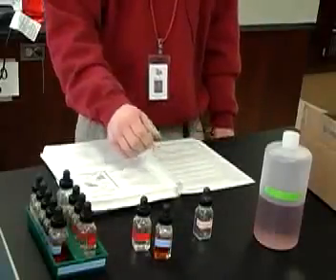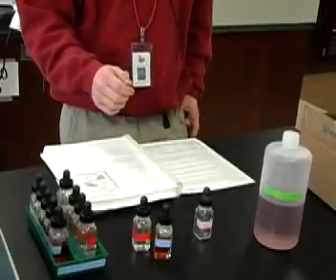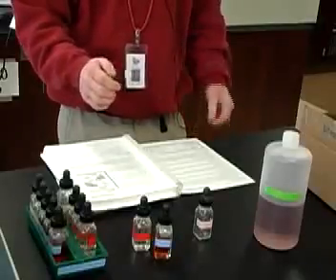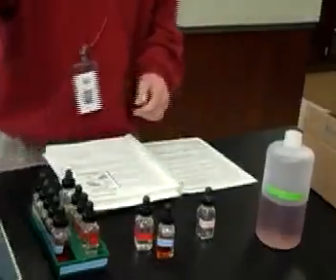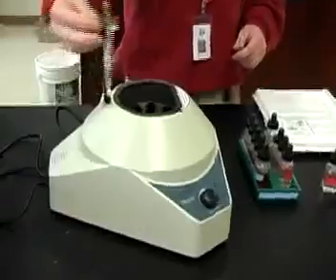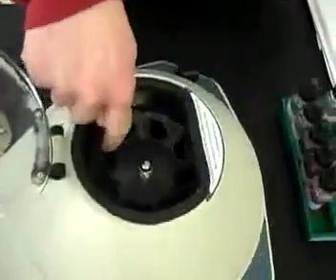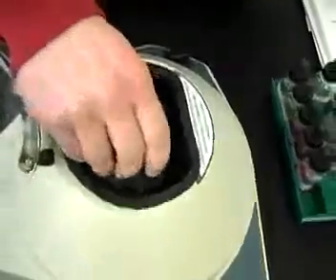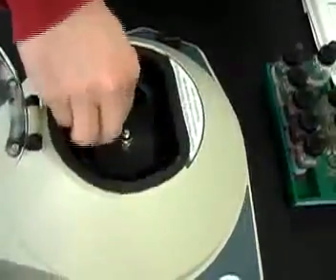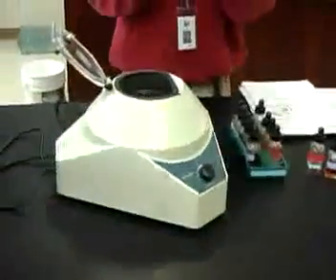Separating solids from solutions. We use what's called a centrifuge to separate the solids from the solutions. This is a centrifuge. We'll have 5 or 6 of these throughout the lab. Notice they have a little top to them, and then they have a little spot right down in here where you could take test tubes and just slide them into the holder. Okay. When you use a centrifuge, it spins the solutions around really fast inside of it.